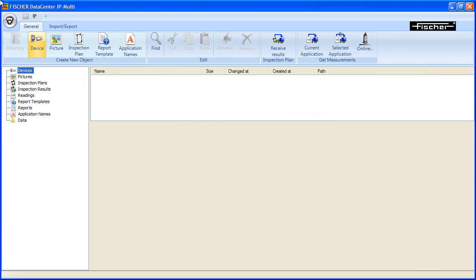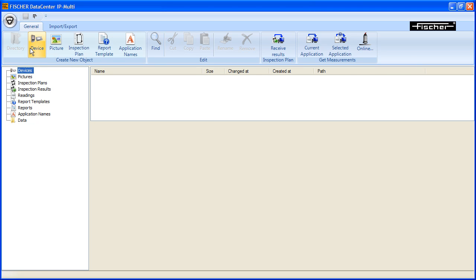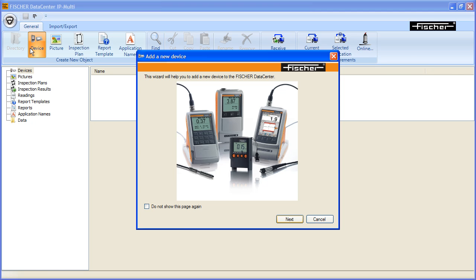After opening the Fischer Data Center software, click the Device button from the menu bar. The setup wizard opens with a brief information. Click Next.